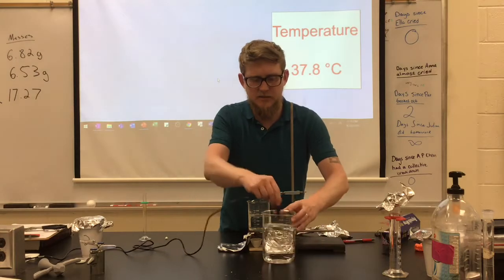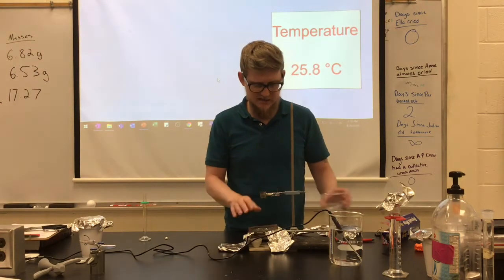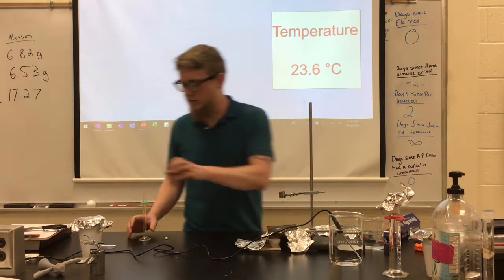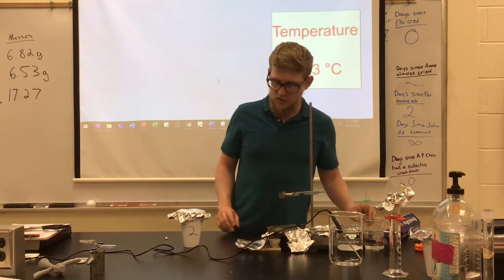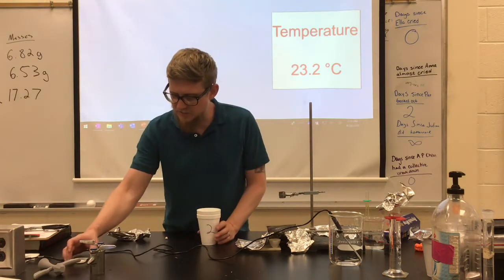Hopefully, I'm just going to rinse this probe off in some distilled water and move this over to the side. This, and we're going to pull out experiment number 2.